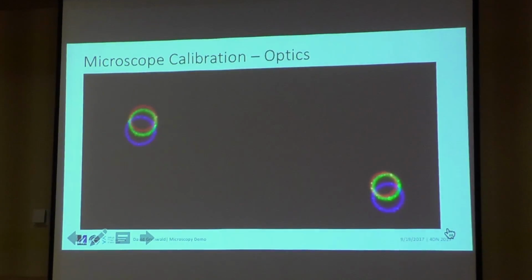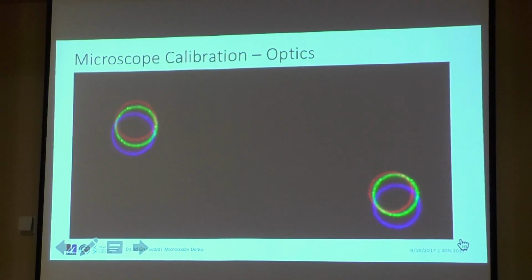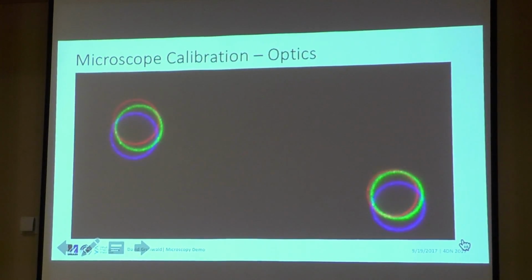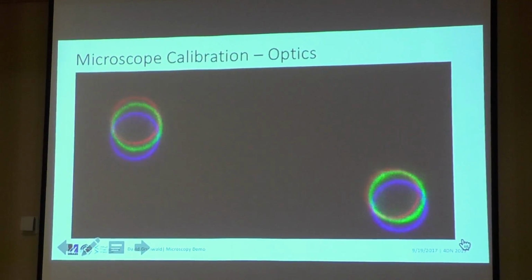Because on this one I can play this movie. So these are focal check beads. Yeah, and they give you an idea about what happens if you go away from the very surface. Because one of the biggest limits that you have with these samples is that they're small. They're within a micrometer or 2 micrometers of your cover glass.